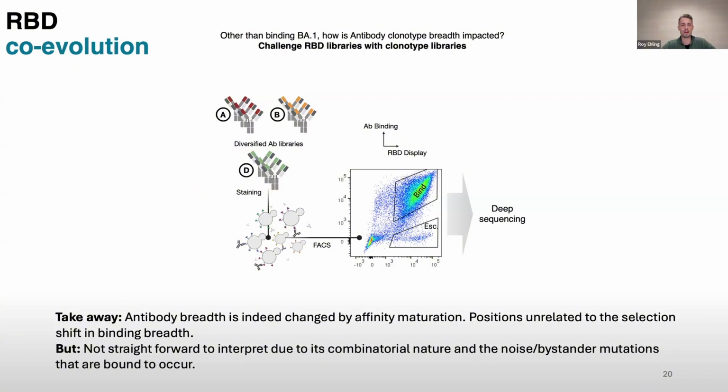I don't think we've tried, but I can imagine that trying to determine the affinity from a polyclonal mixture might be tough. By BLI, right. But I guess you can't get clones out of there. Sure. I mean, we could by single cell sorting our hybridoma, which we then did, and produce individual variants.